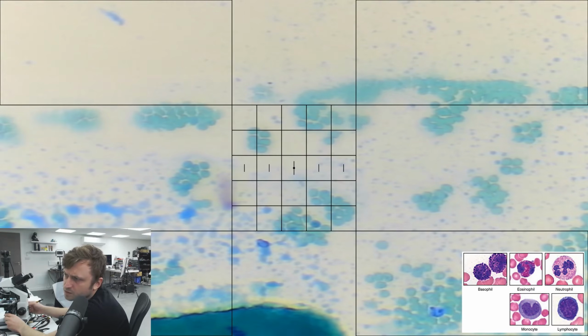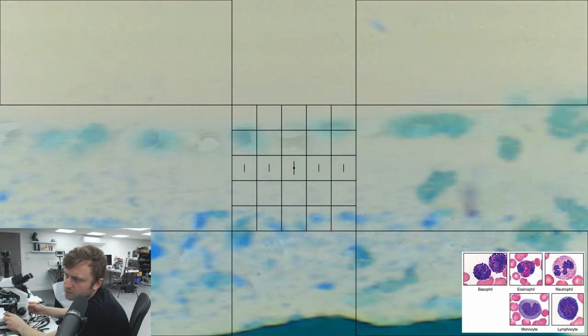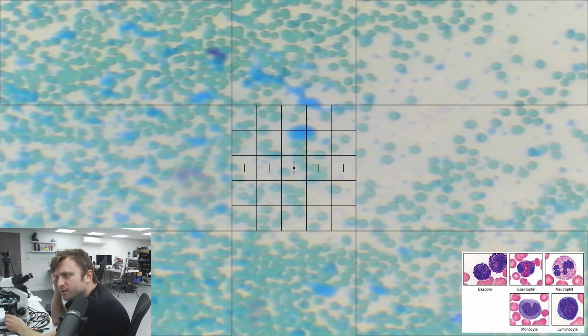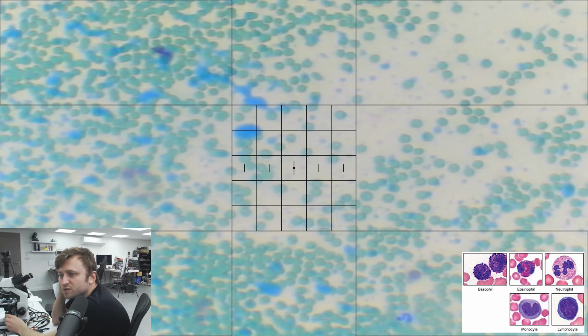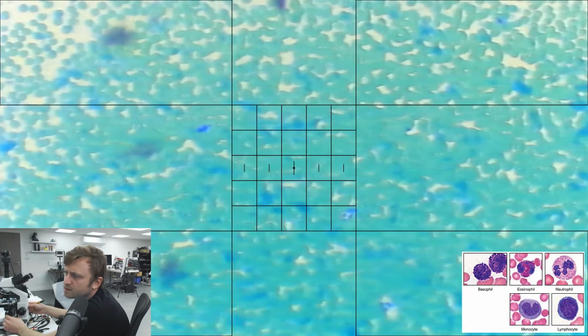Center down. Not sure about that next one though. Might leave that. Okay, that is out of range. Gonna go up and move along. Now, for that clump above, I just don't know whether to consider that anything at all. It might just be pure stain, like residue left over. I'm not going to consider these.